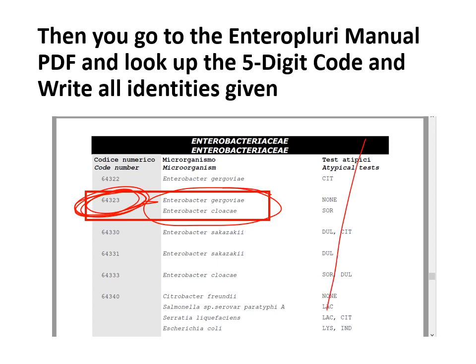Don't worry about what's written here. That's basically telling you that sometimes certain tests will give atypical results, and sometimes that's why you see differences in the possible identities, okay? But you don't have to worry about that.